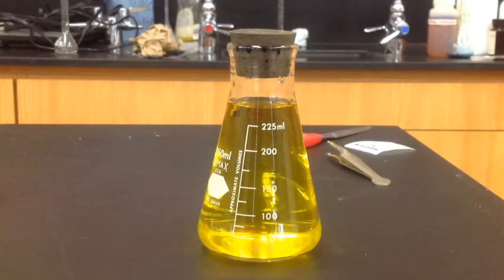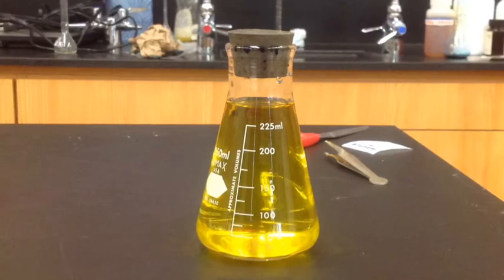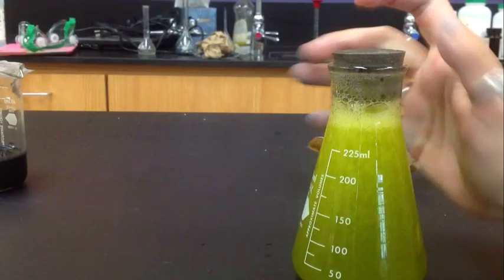In this demonstration, we saw the dextrose, sodium hydroxide, and indigo carmine indicator solution go from yellow to red to green, just by shaking the flask and oxidizing the solution.